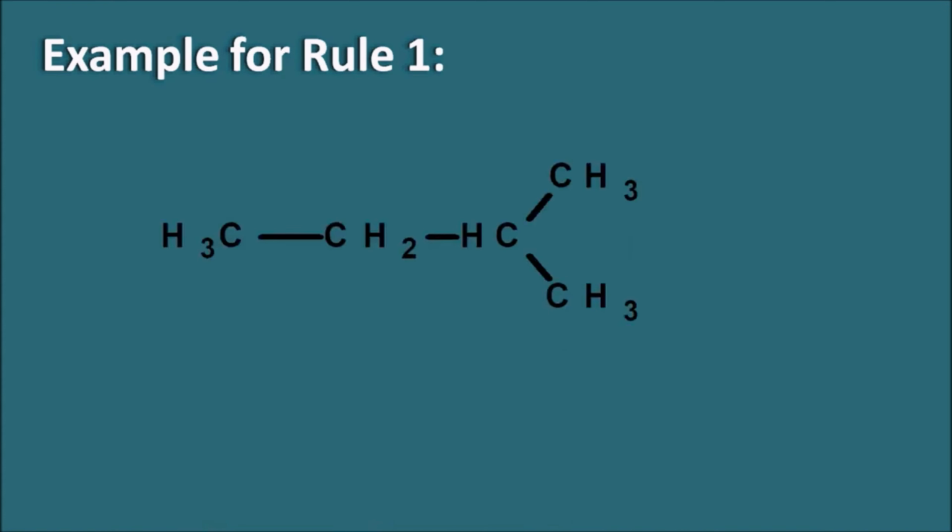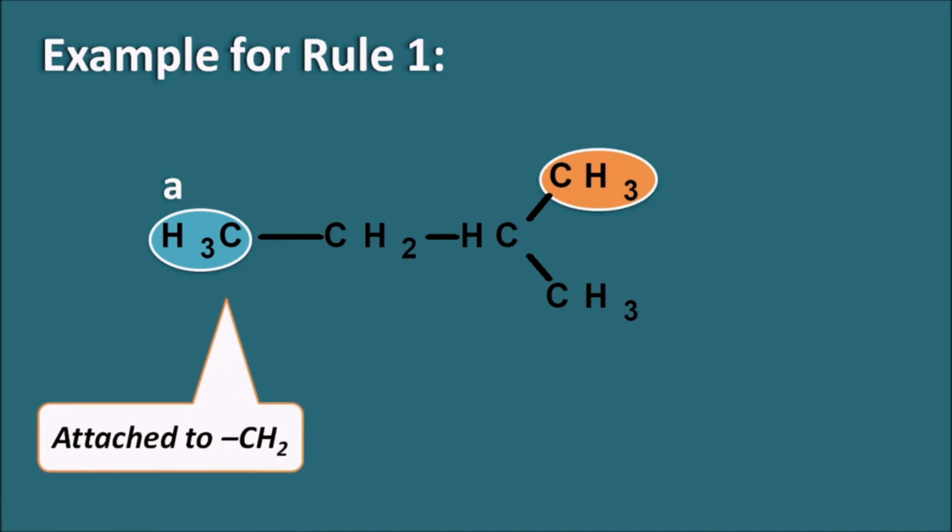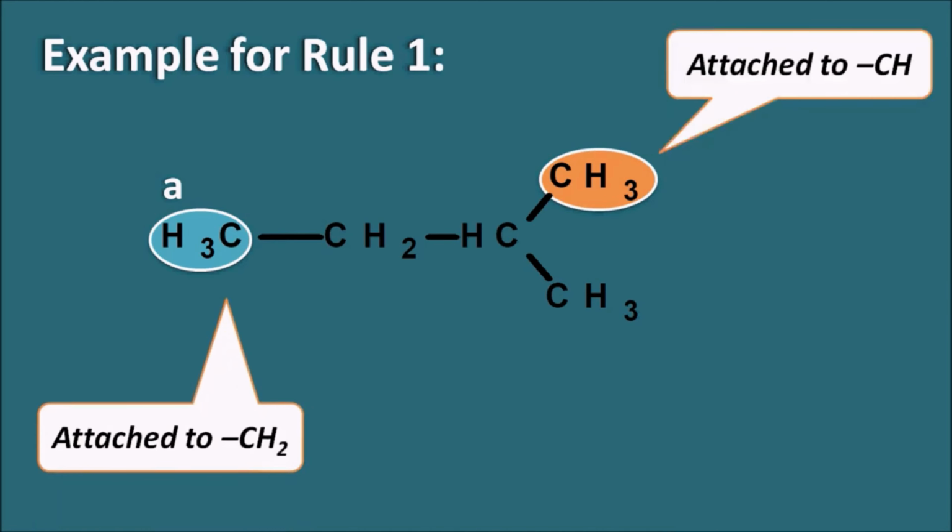So this is one of the structures here, and here we can observe the CH3. CH3 is indicated by letter A, and we can also observe another type of CH3 here. Whether both are chemically equivalent or not? Here the CH3 indicated by letter A is attached to CH2, but here the CH3 is attached to CH. That means they are not chemically equivalent because they have a different linkage. Therefore, they are magnetically also not equivalent. We can indicate this proton as B. And this CH3 is equivalent to the proton B, so again we can indicate it by letter B.